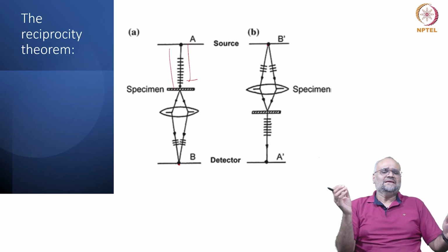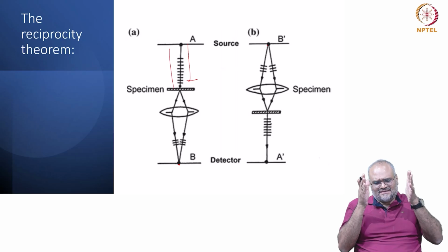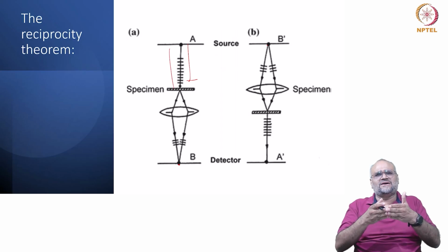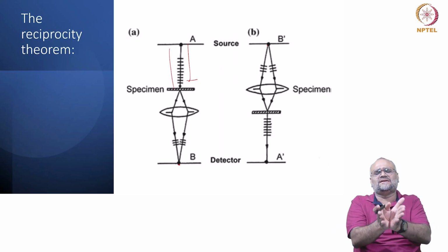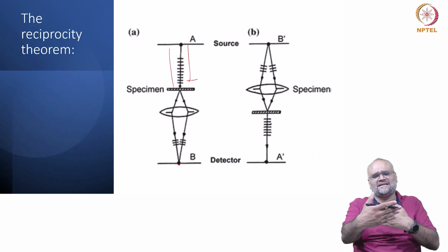That means if I have from the source at a given brightness n number of electrons hitting my specimen, if it is in the STEM mode, they would only go in and deposit as a spot, and the cone that is forward scattered is constructed to form the image. Whereas in TEM mode I have a broad beam which is going through the specimen, and I am collecting the entire forward scattered electrons here.